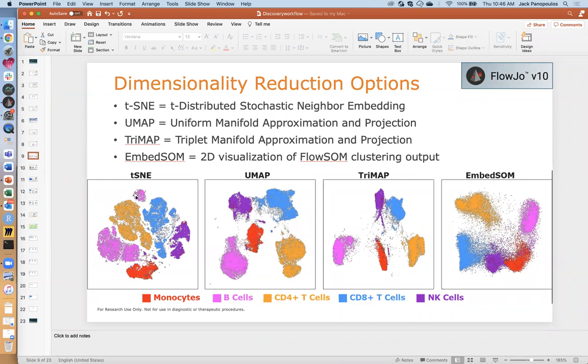But when I look at this, I can see one island over here, another island over here, this island right here, and then this island off to the right that looks like it's kind of breaking off from the main one. So at the minimum, I could see maybe 3 different populations, and at max, I might be looking at 4 here when I just first glance at this.